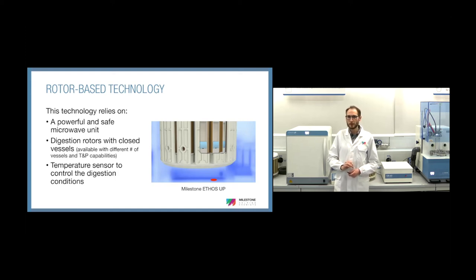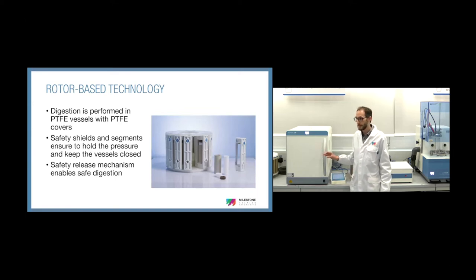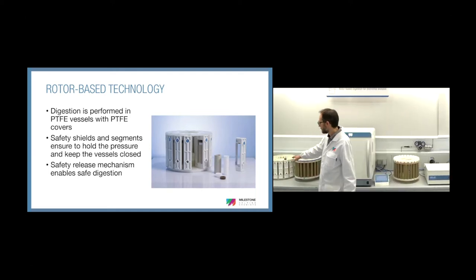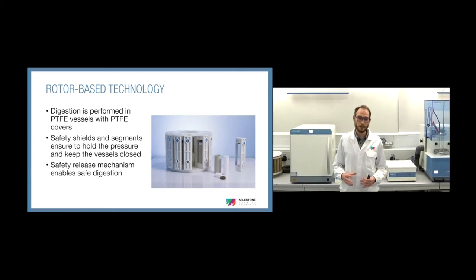What is extremely important when you are evaluating a unit like that is the configuration, so the rotor that you need. If we consider lithium-ion battery components, as I told you, most of them are inorganic, and it means that you require a system that is able to reach very high temperature conditions. For that reason, the best configuration for this kind of sample is the use of high temperature and pressure rotors. A rotor like this one that you also see in the picture is usually highly recommended for the digestion of very complex sample matrices like lithium-ion battery components.